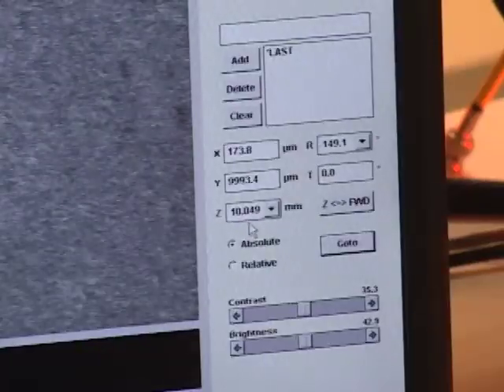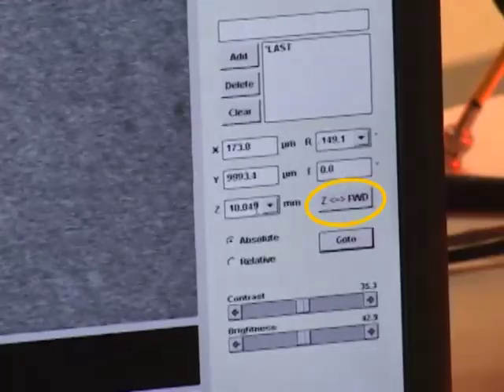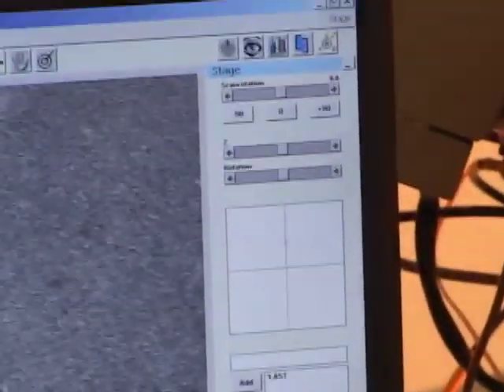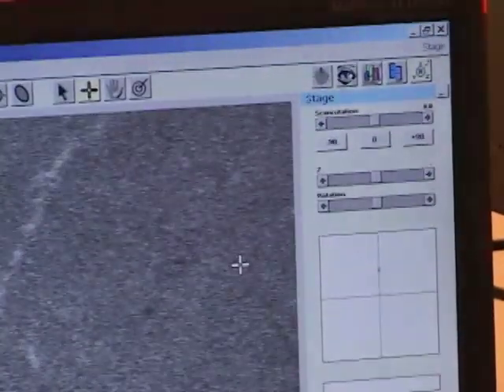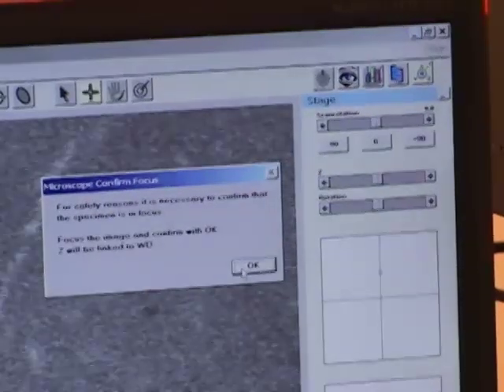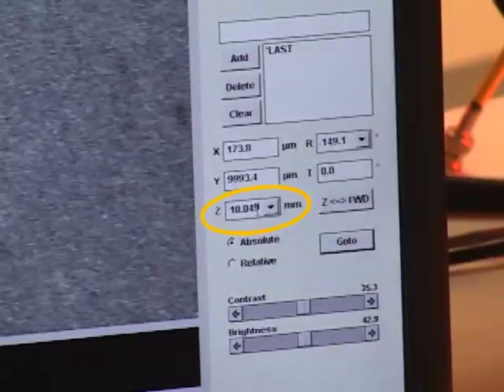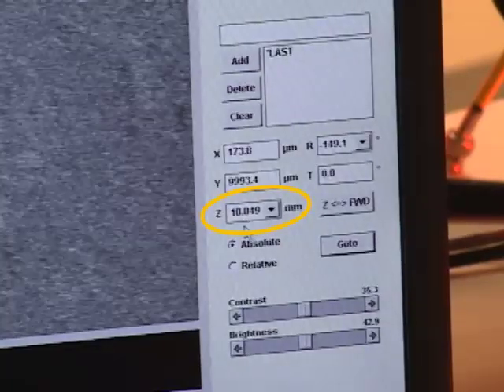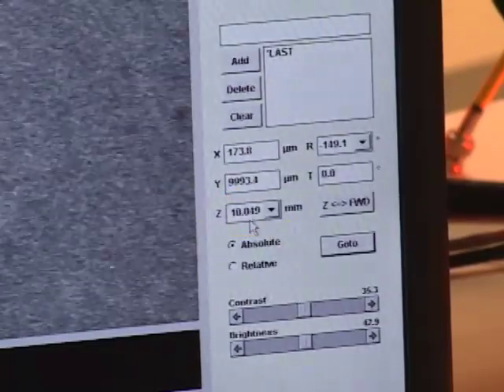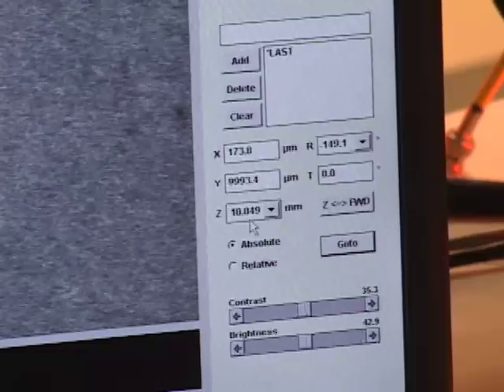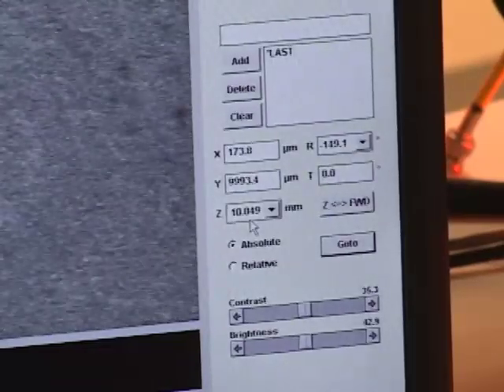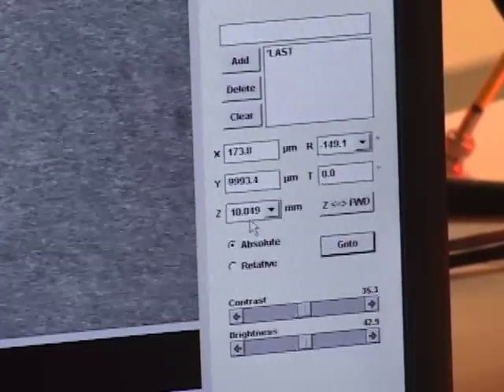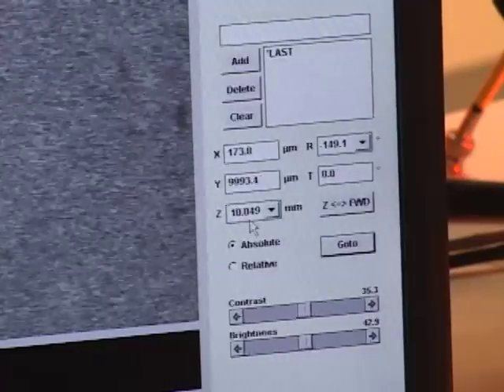To get the dialog box back, I click on Z, forward working distance. And again, I want to confirm that the sample's in focus at more than 2000x by clicking OK. And you see that it's updated the Z height with 10.049 millimeters. So I was off in my initial movement by 0.049 millimeters, which isn't much under normal circumstances, but it makes quite a difference in the focal length when we're actually trying to look at a sample.